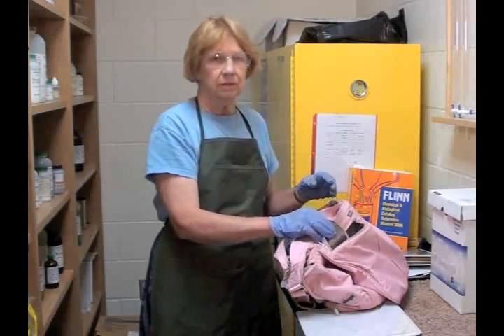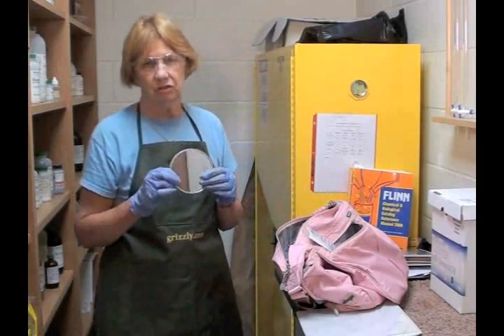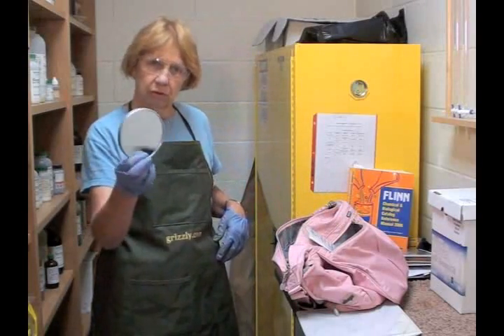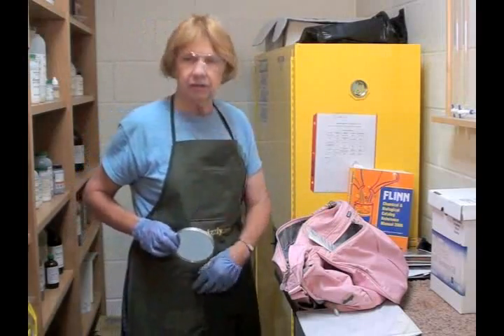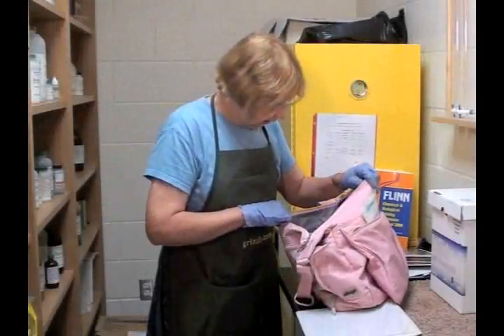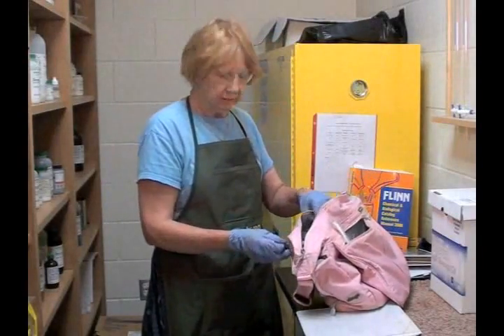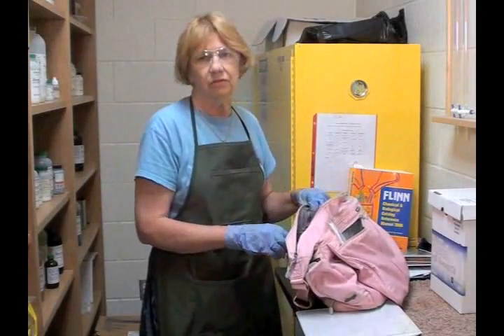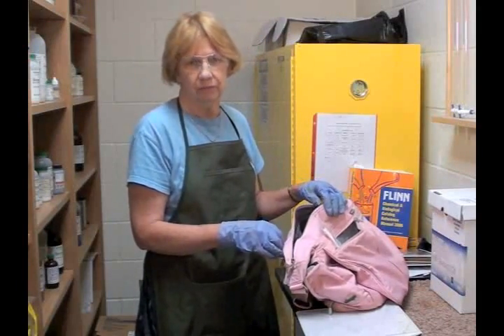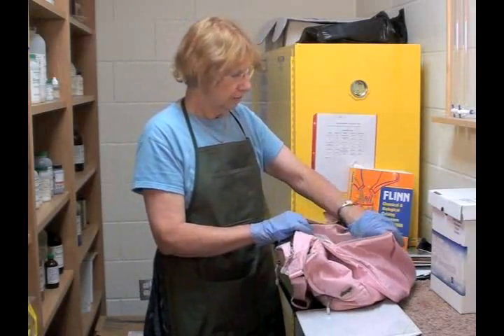If the inventory hasn't been done in some years, a mirror is a good thing to have so that you don't have to touch the container. You can just orient the mirror so that you can see and read the label. You just have to learn to read backwards. Then you'll need a sharp pencil. I prefer to do the inventory with a pencil because so often you will find another container of the same chemical in another area of the storeroom, and so that way you can modify the total amount.